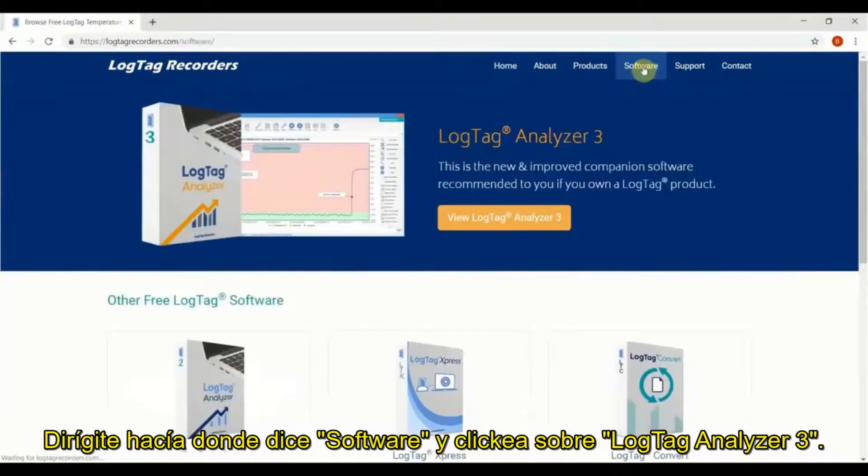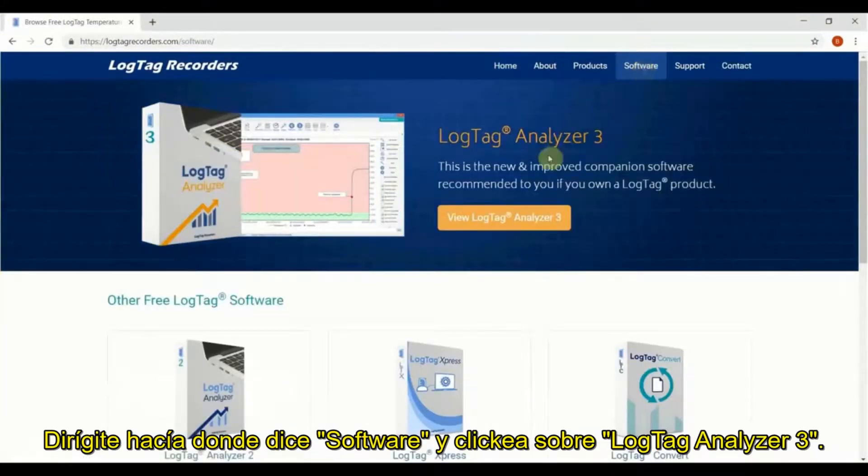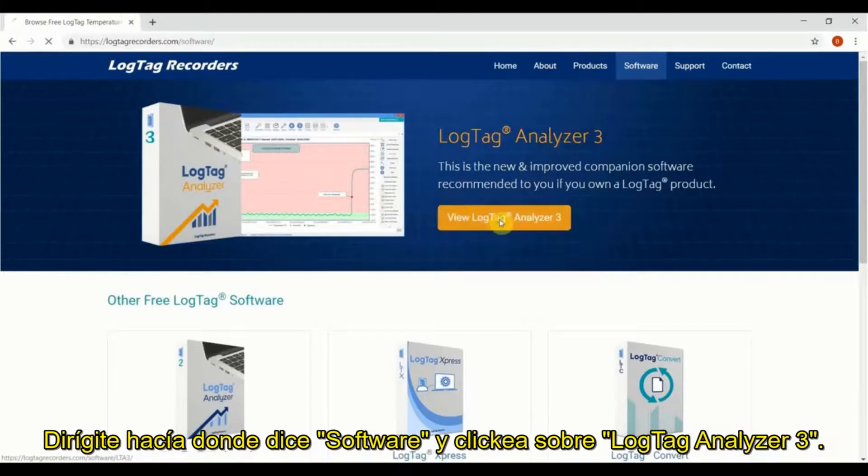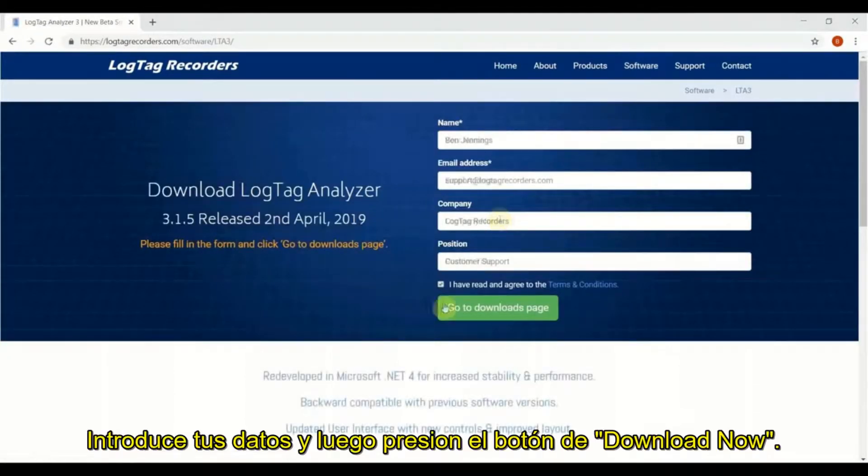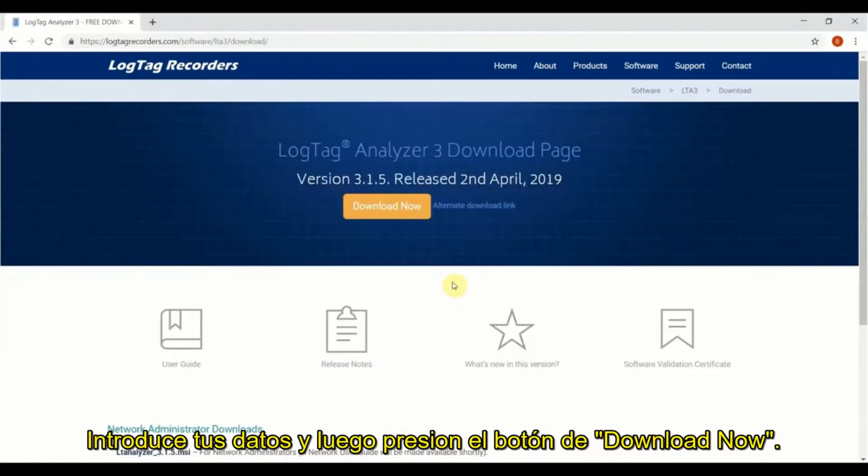Navigate to software, click on LogTag Analyzer 3. Enter in your details and finally click download now.